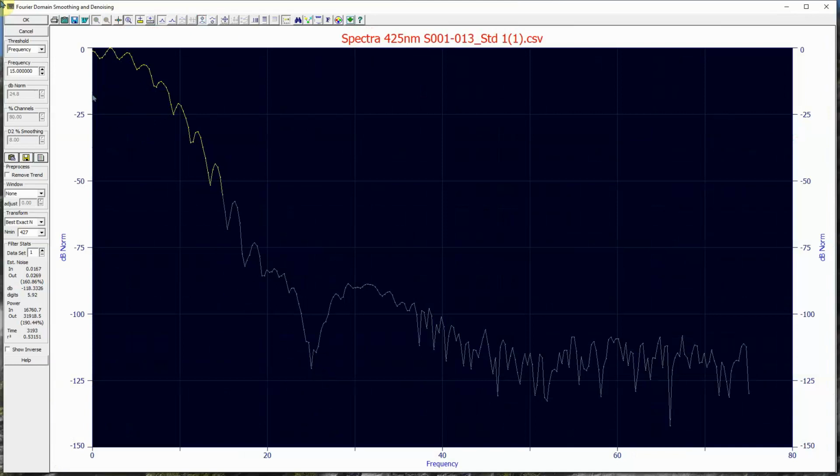This is where you're looking at the peak information, where you're looking at signal. This is where the deconvolution has produced additional noise. In this particular case, the value is so small you could get away largely without a filter, but for many different types of chromatographic data sets, that's not the case.